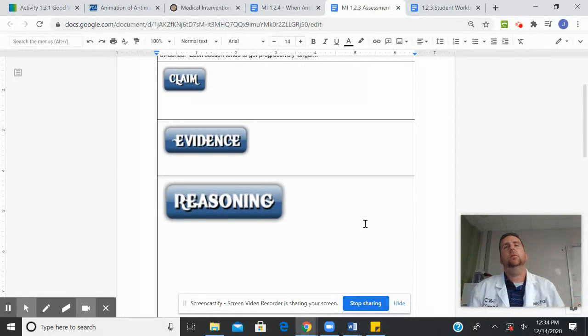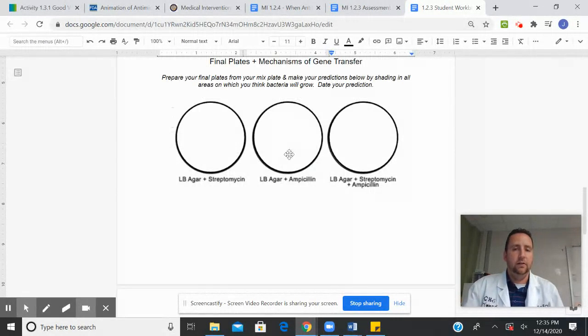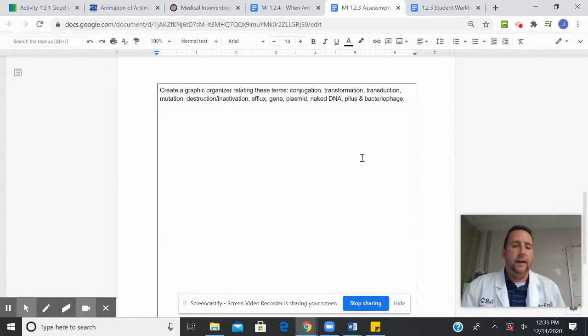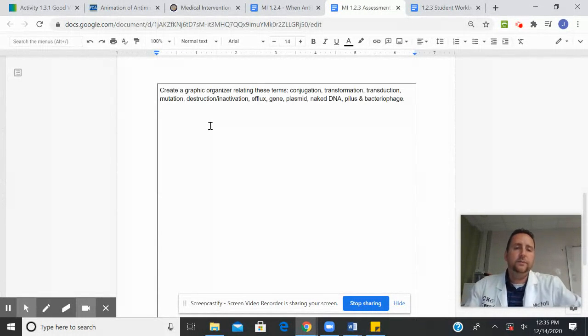All right, so think about which way it had to go in order for the bacterial transfer to take place, assuming that it did, assuming that our plates here all were positive. And the other part of that, which I see being done in class more, whereas this part is probably something you have to work on at home, is summing up all the things from this activity.